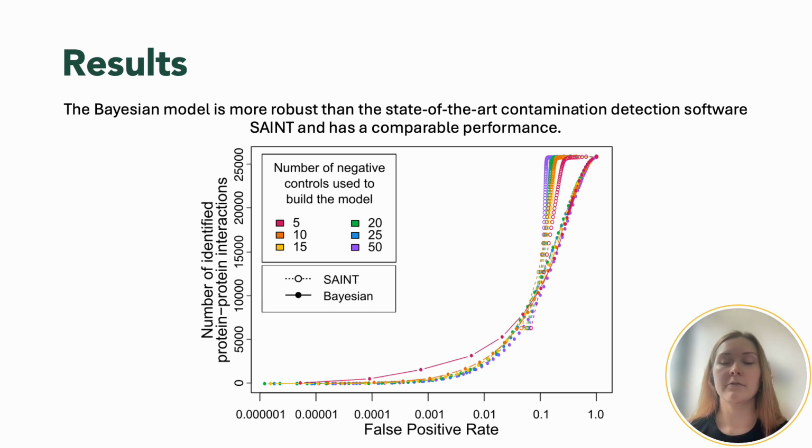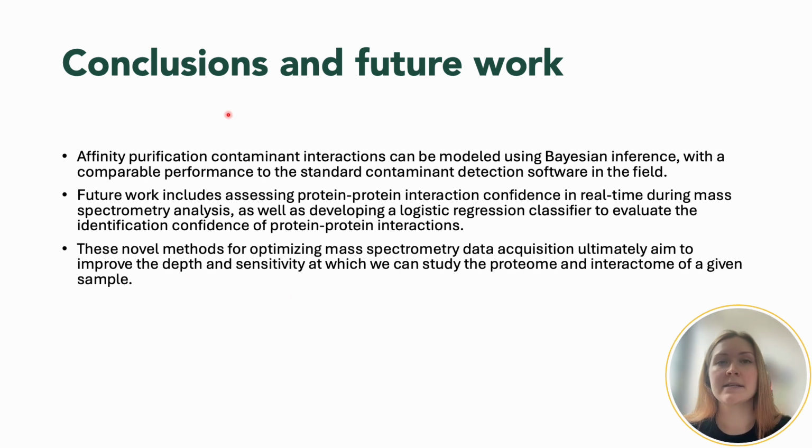So it's very exciting for us to see that our Bayesian model has a comparable performance to the current gold standard in the field, because while SAINT is the leading tool, it cannot be used for real-time analyses. So this really gives us good confidence in the Bayesian model as a candidate to proceed further with and integrate into real-time analysis. As such, my next steps are to use this model in real-time simulations and on a mass spectrometer to guide data acquisition. But so far, we've really shown that with our algorithm, we have the capability to detect contaminant protein-protein interactions in real time, which is really unprecedented in the field.